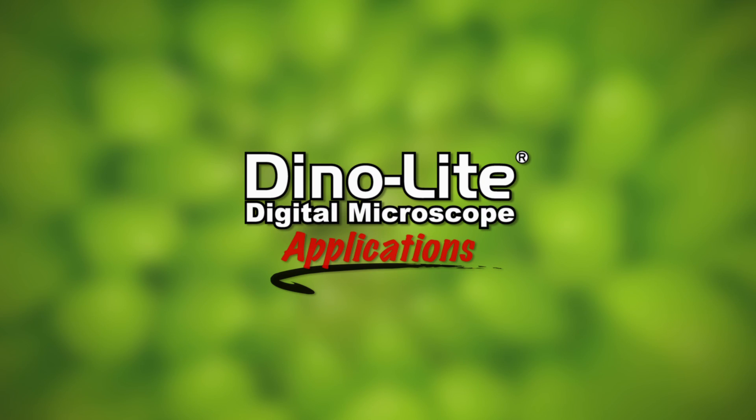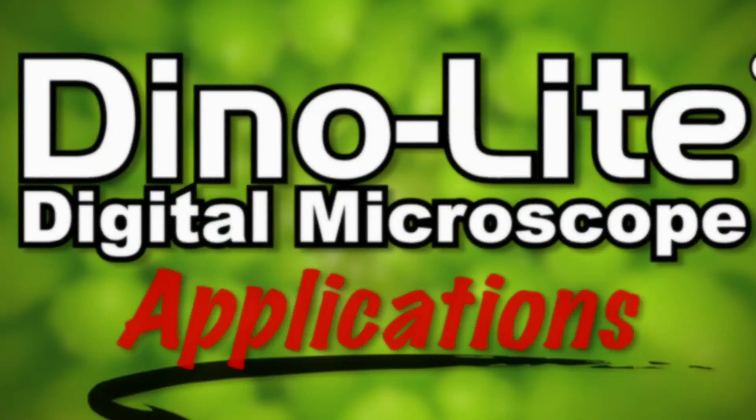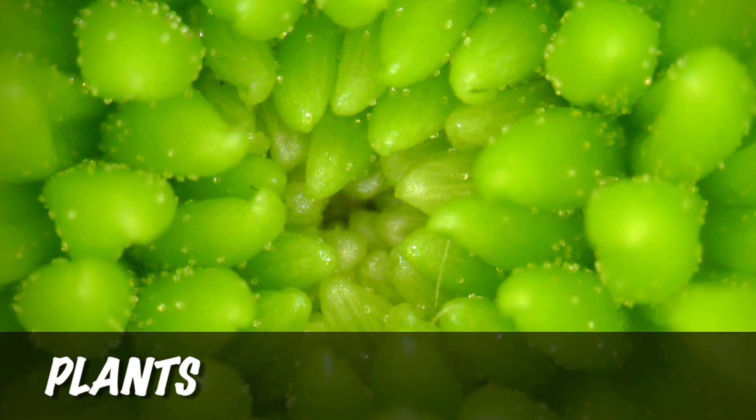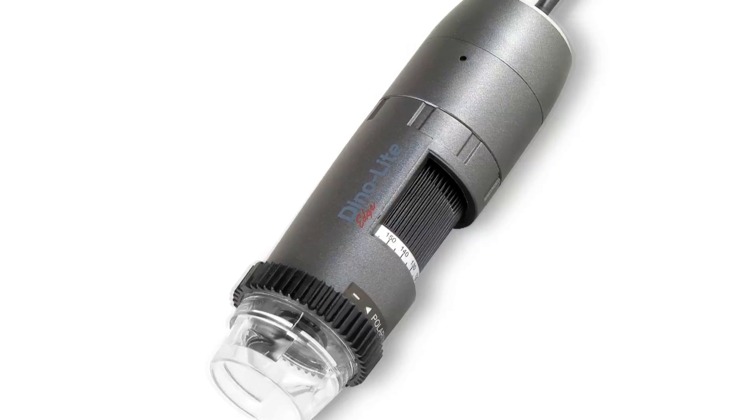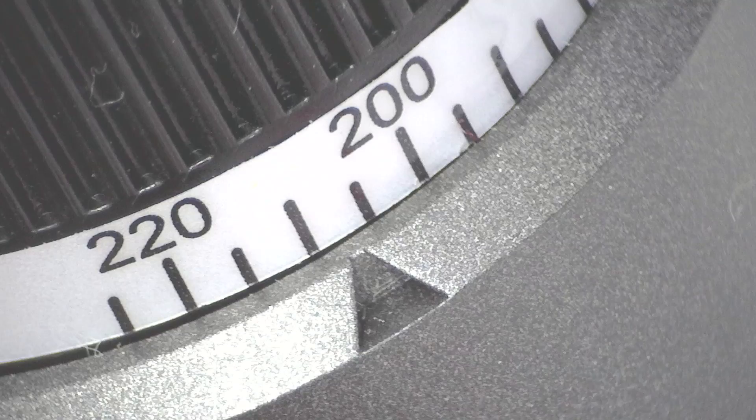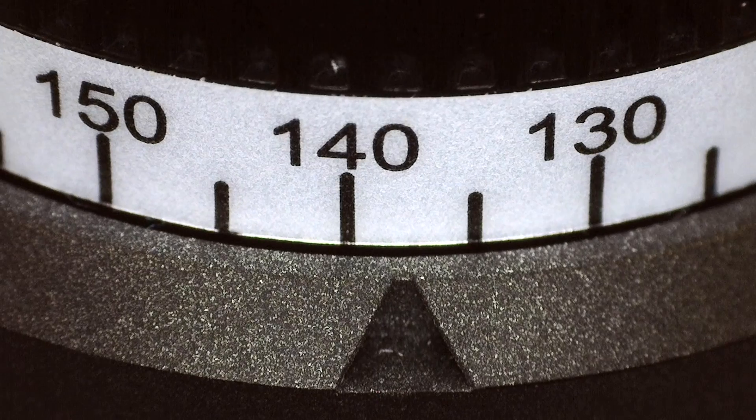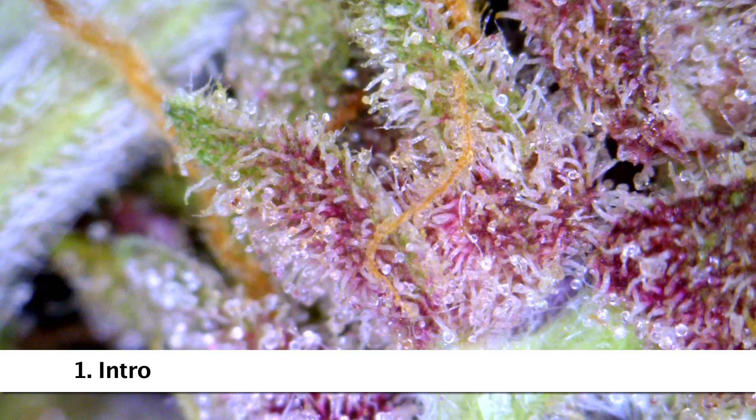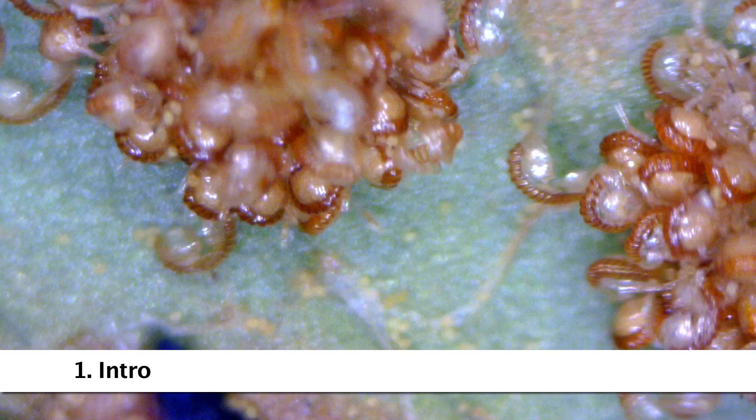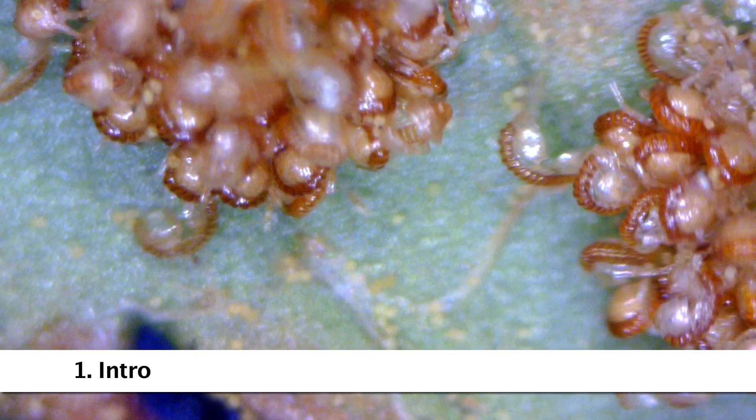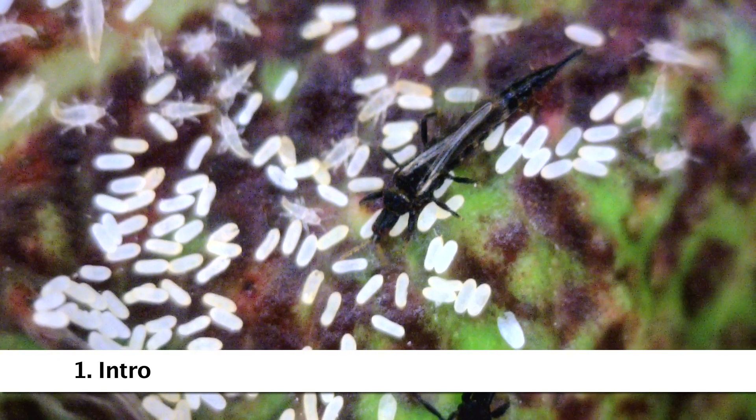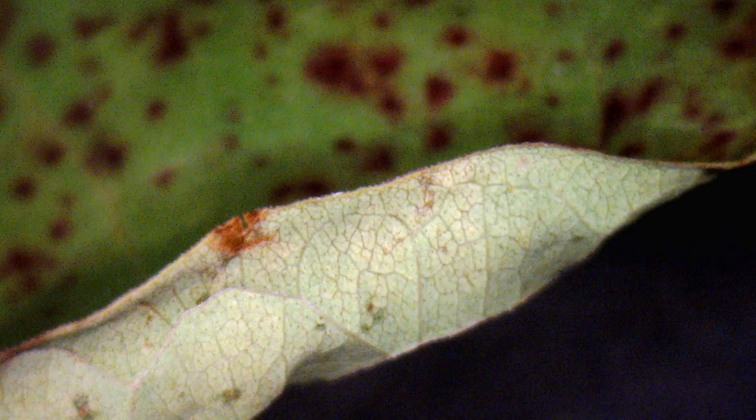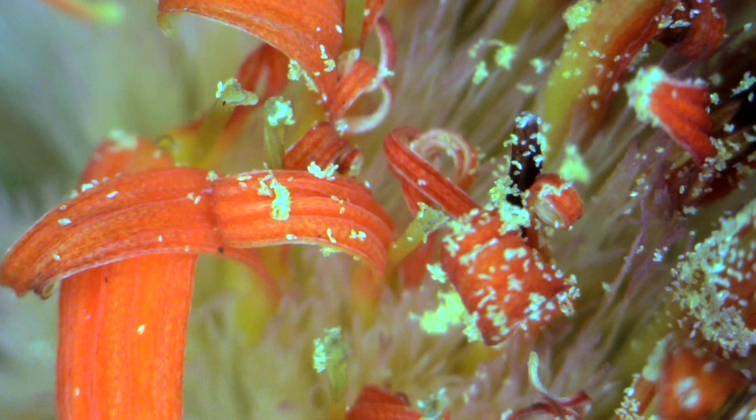This is a Dynolite Digital Microscope video focusing on plants and related applications. In this video, we'll introduce the Dynolite, its features and results, show how it's used, and some of the available options including Dynolite models and accessories.